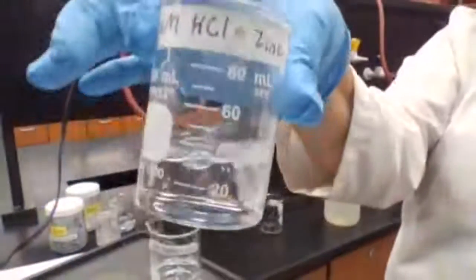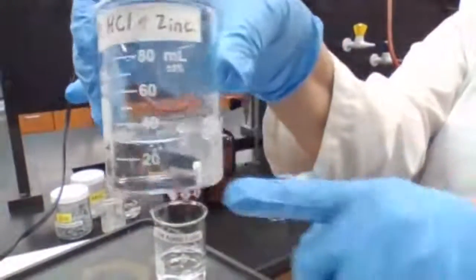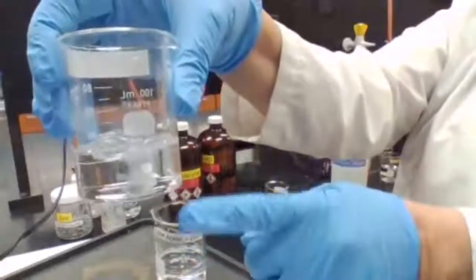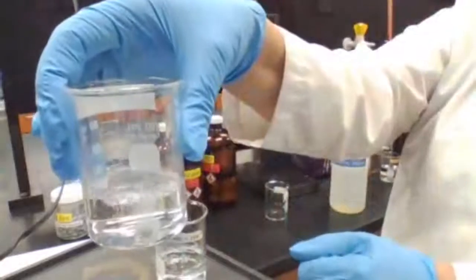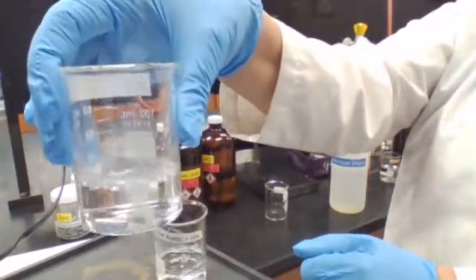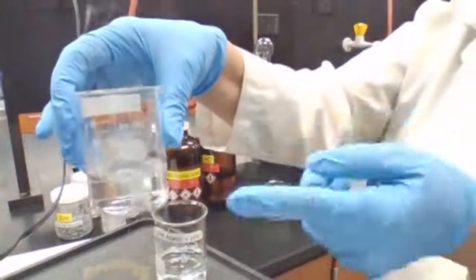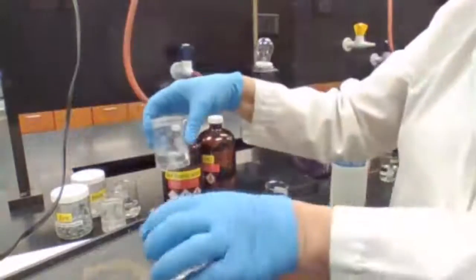This is the HCl plus the zinc. You see the bubbles that are forming. It's a very aggressive reaction. I see the hydrogen coming out. I usually do this experiment inside the fume hood, but for recording purposes, I took it out.